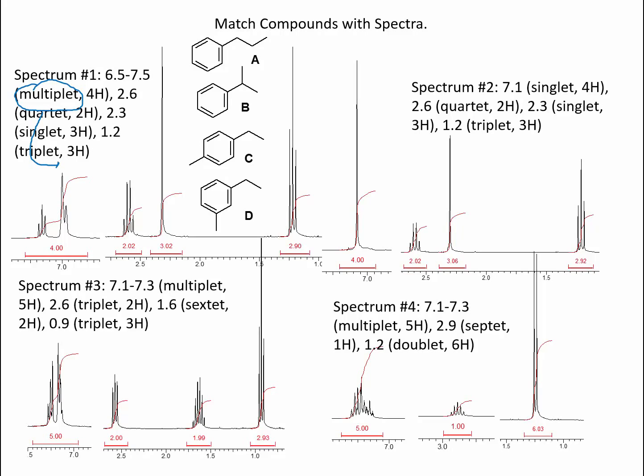And this is when we have overlapping signals, and we can't tell what the signal is because of the overlap. The overlap makes it messy.